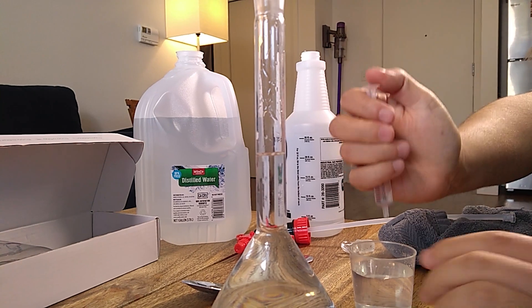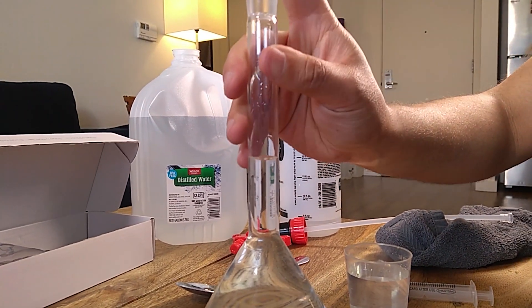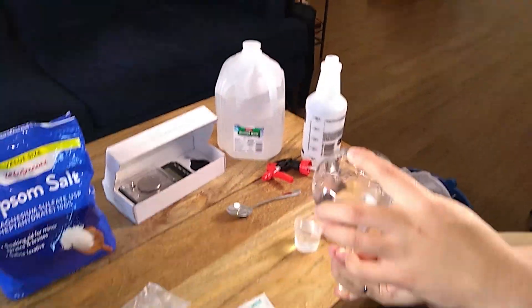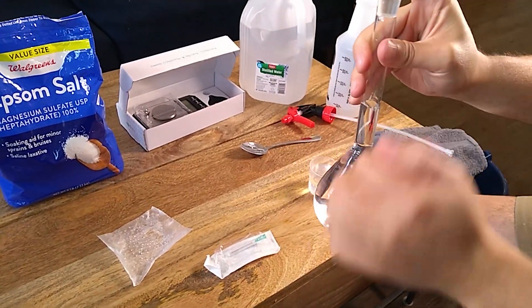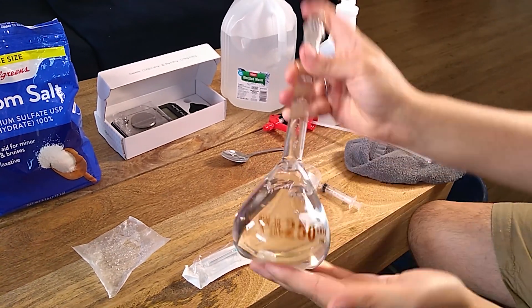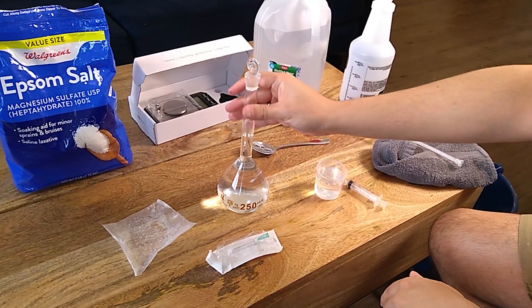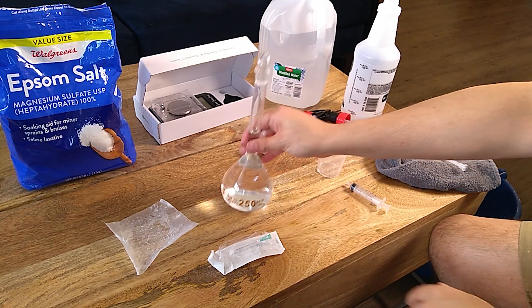Then you're going to just add water from the syringe until the meniscus is right above the line. Right there. Now you close it. And you will just mix it by inverting it — up, down, up, down — and this will be your final concentrated solution.